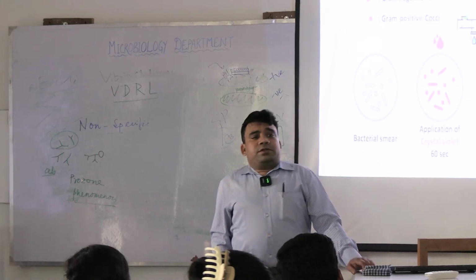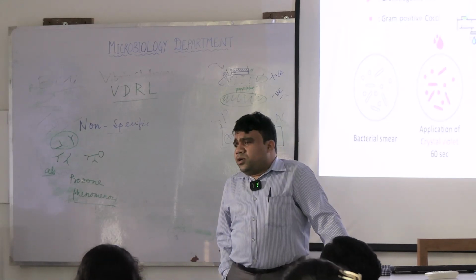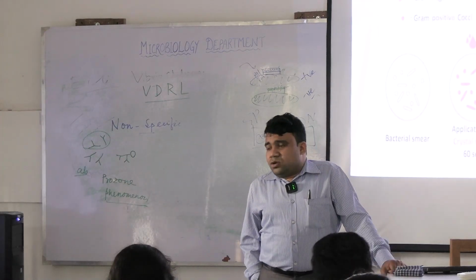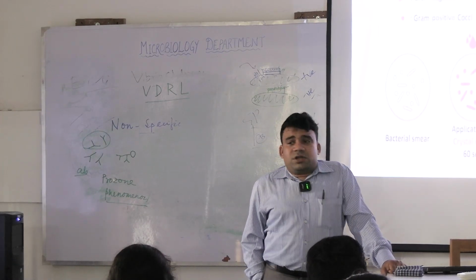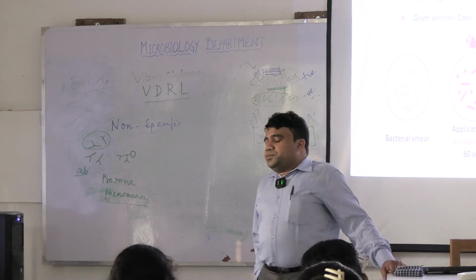What is the role of iodine? In simple terms, in some of the books, it is written it acts as a mordant. If you say that it acts as a mordant, fine. Nobody will argue with you. But if you try to understand how it exactly occurs, I'll tell you.